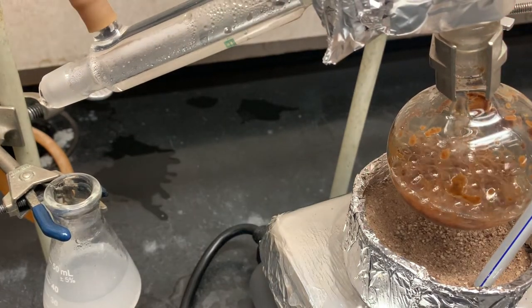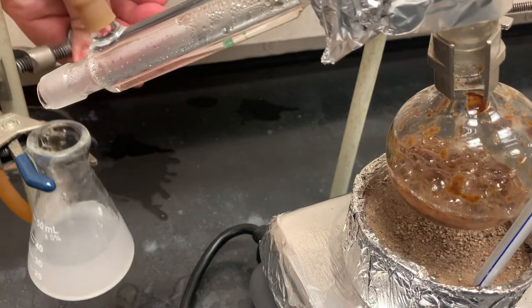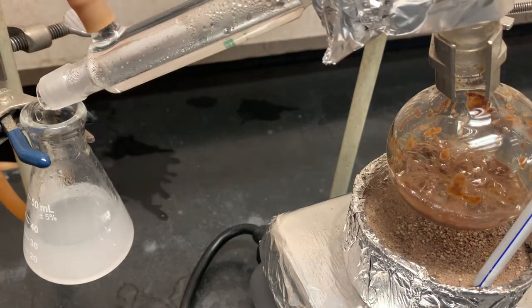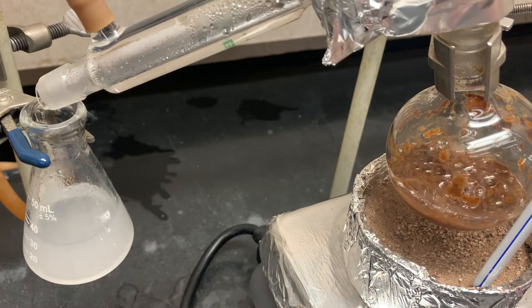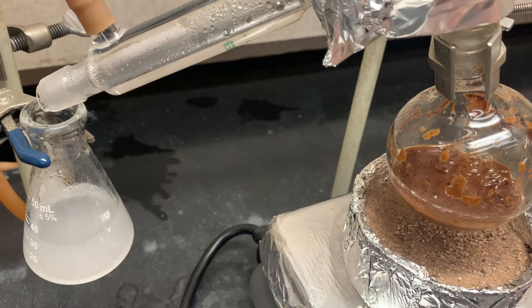Make sure you lift up the receiving flask as well to catch any last minute drops that come out of the condenser. We will let this whole thing sit until it's cool enough for us to handle.